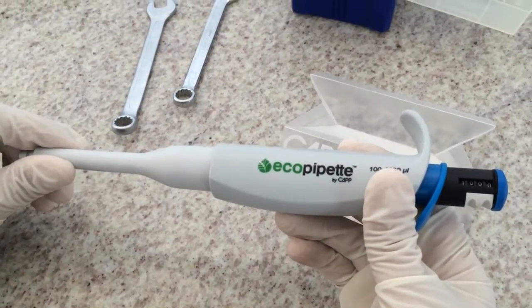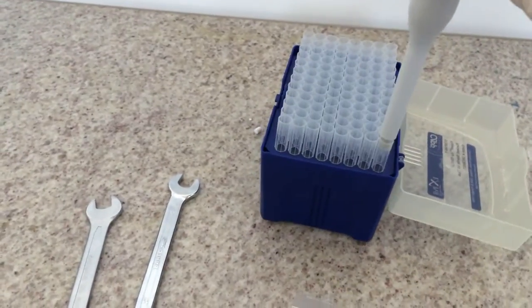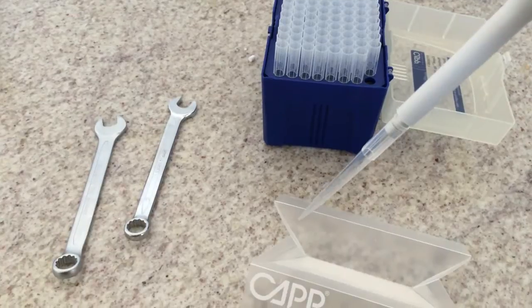In addition to that, in order to minimize the evaporation factor, it is recommended that you pre-wet the tip 4 times.